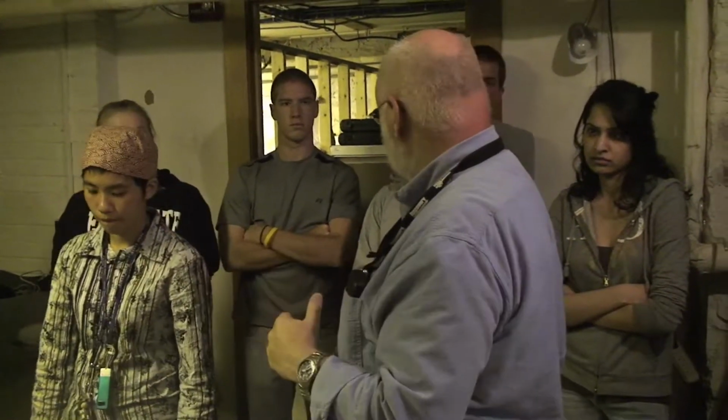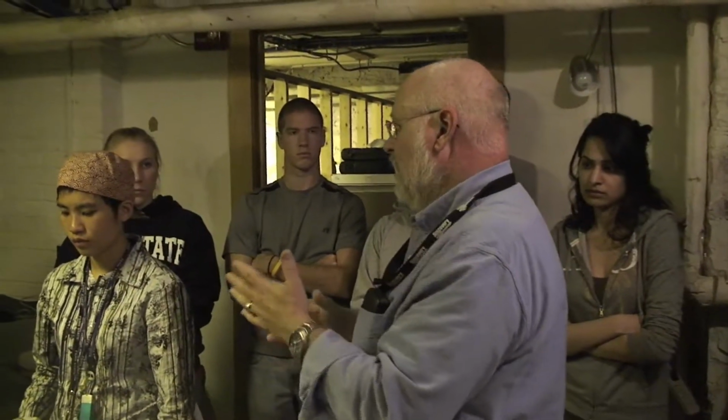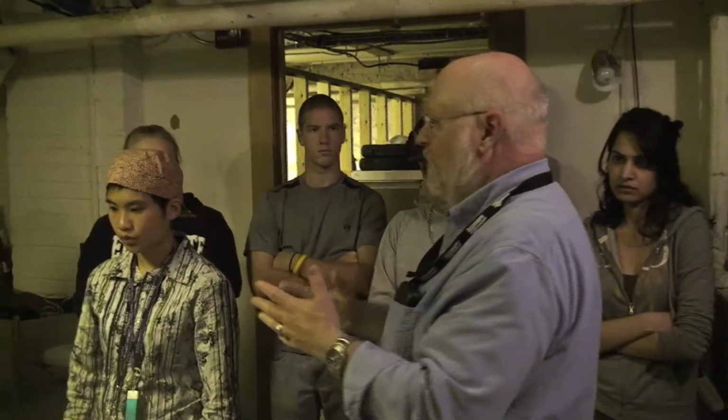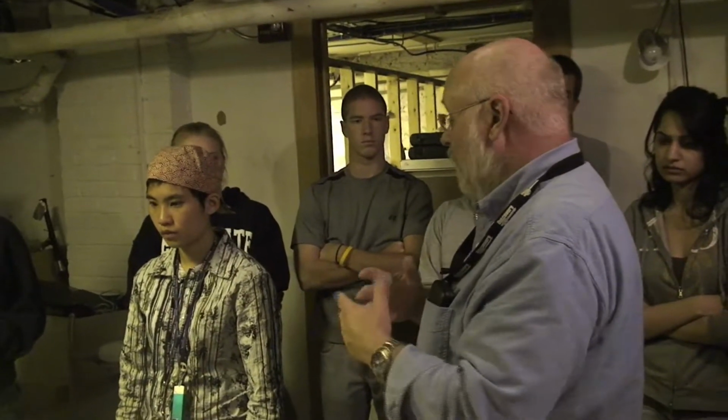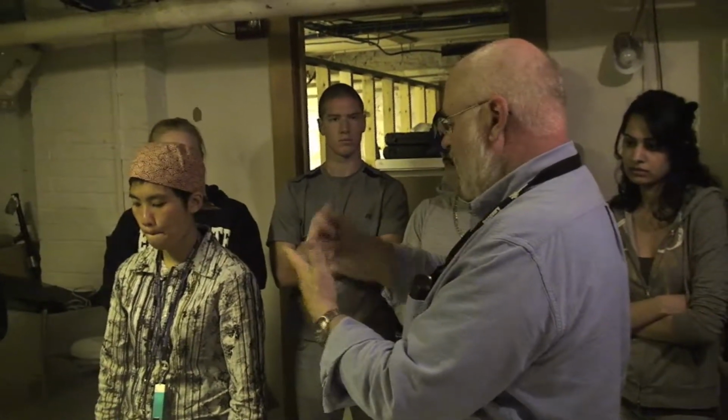The British just did a study and they found it to be just as sensitive, or DFO to be just as sensitive. The difference between the two is that the DFO reaction is slower than the indane-dione reaction, but we're going to use sufficient enough heat to make it go pretty quickly. So we're going to be doing a cascade of first DFO and then ninhydrin. You can't do the reverse.